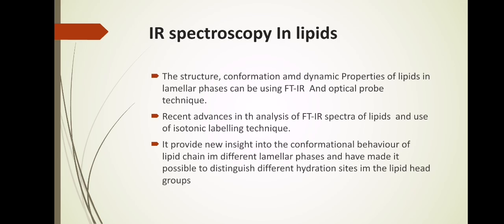Infrared spectroscopy in lipids. The structure, conformation and dynamic properties of lipids in lamellar phases can be studied using FTIR and optical probe techniques. Recent advances in the analysis of FTIR spectra of lipids and use of isotopic labeling techniques provide new insight into the conformational behavior of lipid chains in different lamellar phases and have made it possible to distinguish different hydration sites in the lipid head groups.